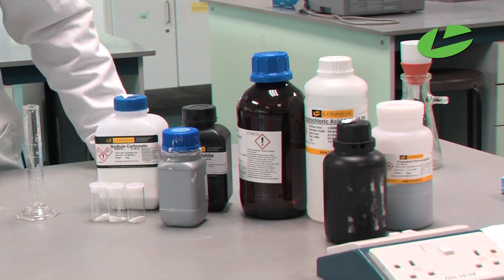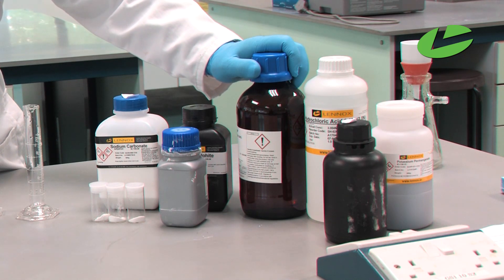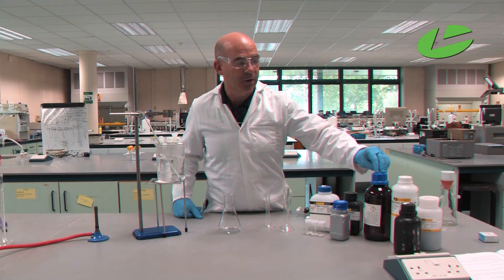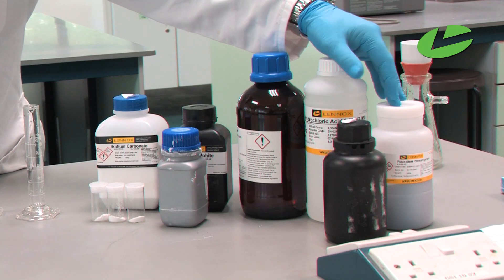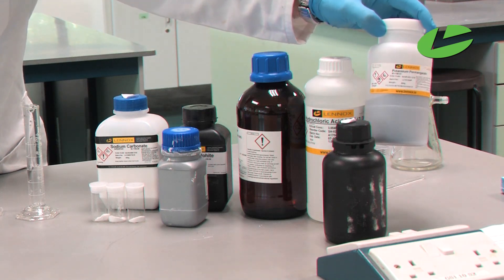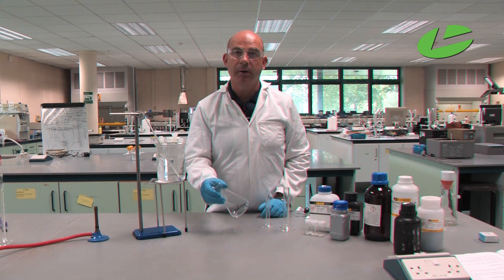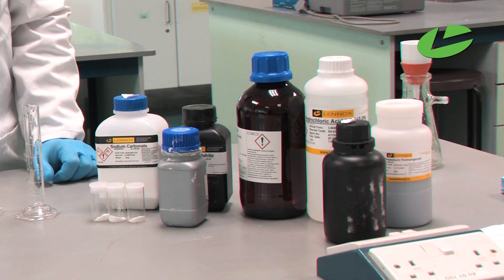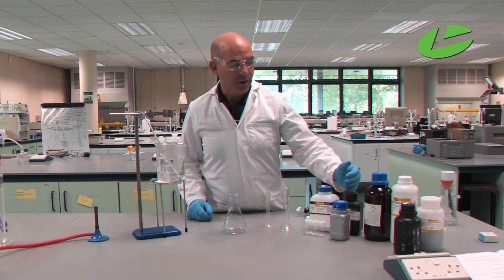To carry out this reaction, we start with benzyl alcohol as our starting material and oxidize it with a potassium permanganate solution — a 0.5 molar potassium permanganate solution that I've already prepared. We then react that in a conical flask along with some sodium carbonate, sodium sulfite, and hydrochloric acid, all of which I have here in front of me.